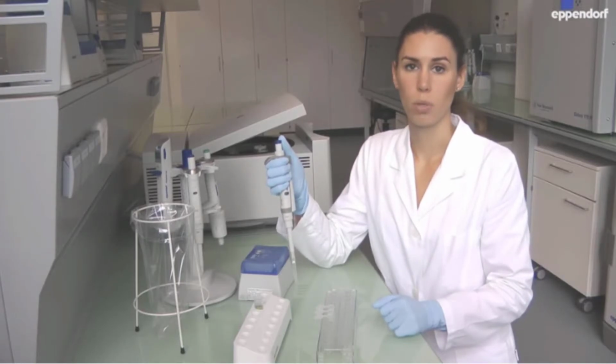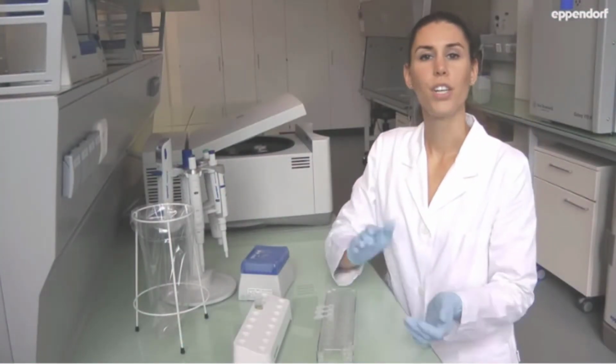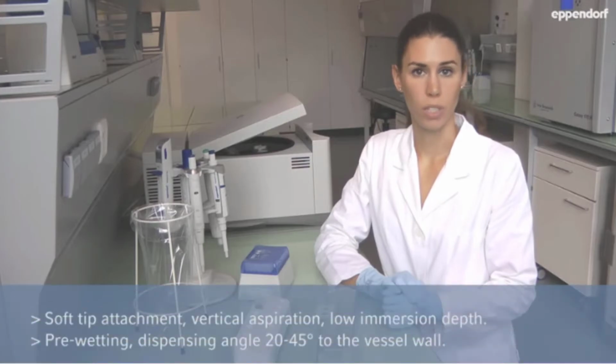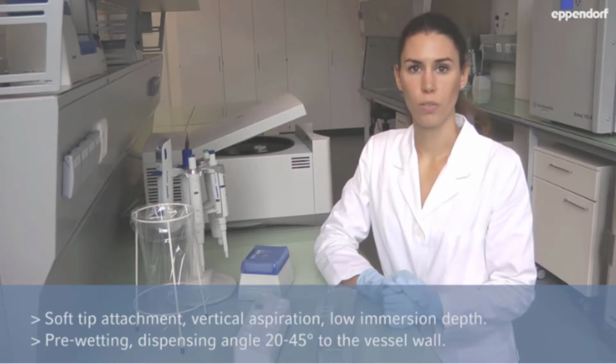The last step during pipetting is ejection of the tip into a garbage bin by pressing the ejector button. Achieve accurate and reliable pipetting results with soft tip attachment, vertical aspiration, a low immersion depth, and a 20 to 45 degree dispensing angle directly in contact with the vessel wall. So, improve your pipetting skills.